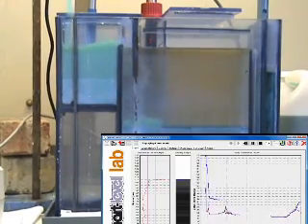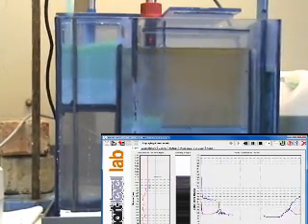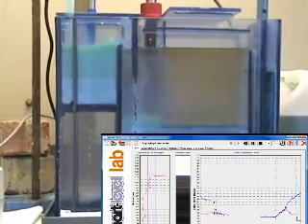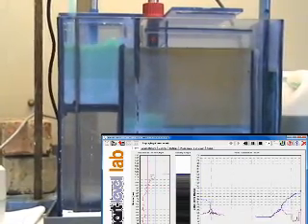Here we overlay the screen. Software display. And you'll see the levels reflect the emulsion phase thickness.